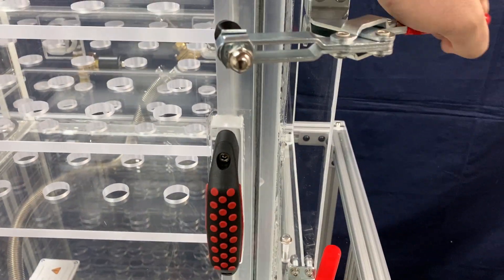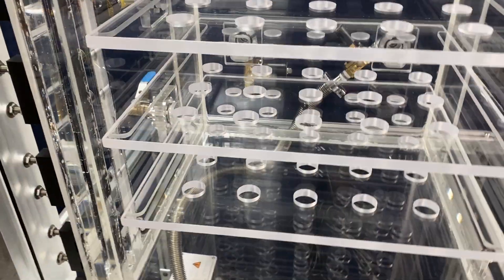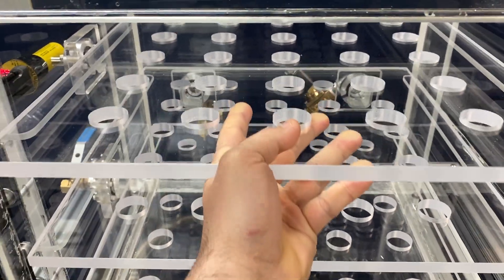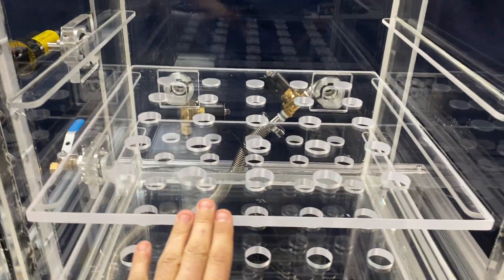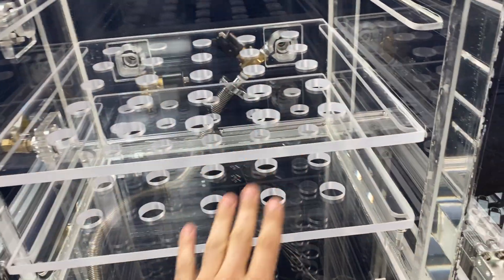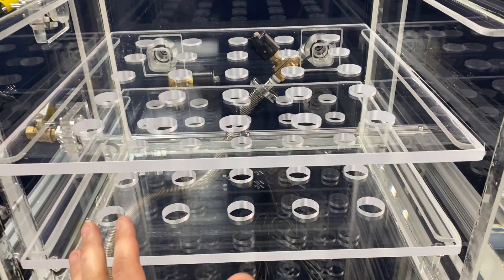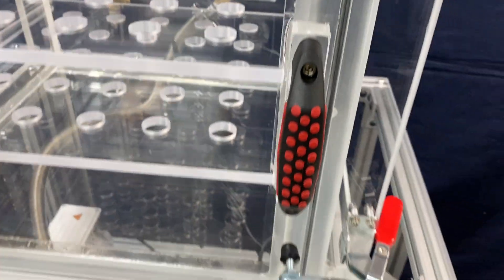Let me show you something else before we go into the controller — this is how you open the door. These shelves are fully removable. They can be configured however you want — you can place them in any position, remove them fully, or have one or two, whichever combination you prefer.